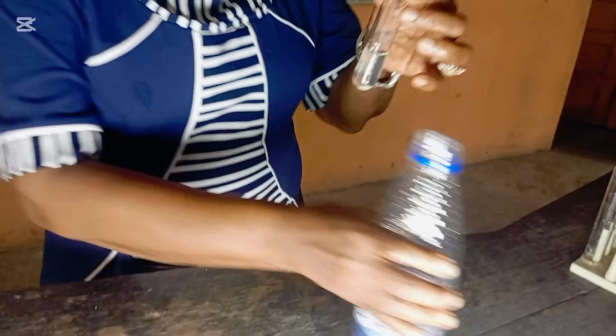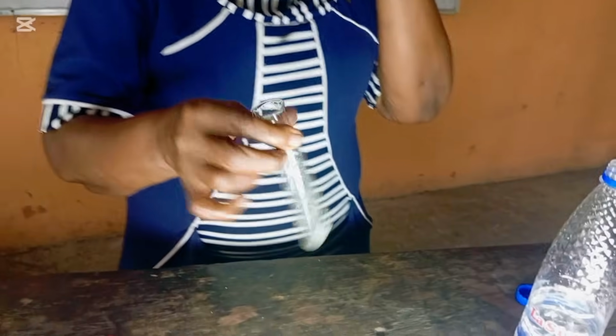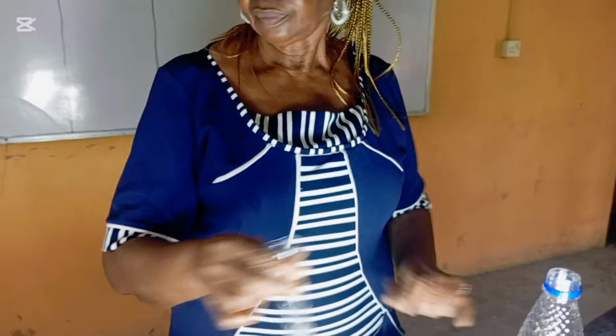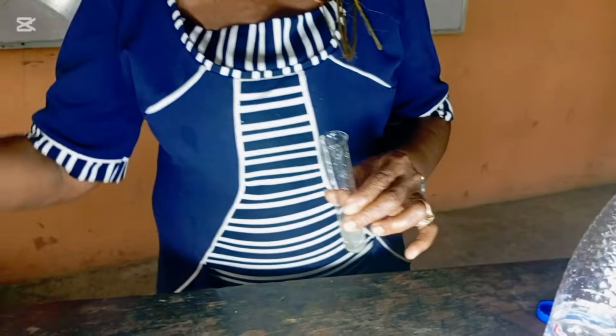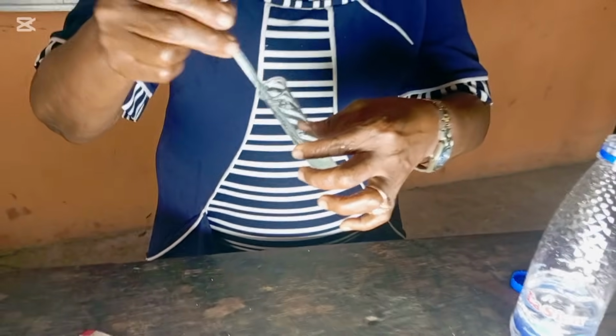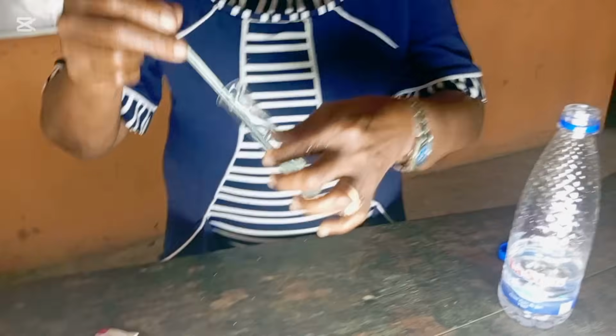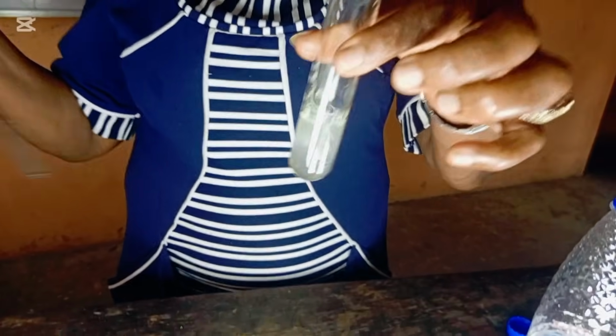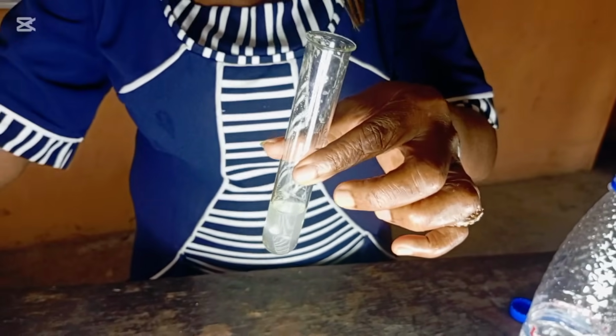Allow it to dissolve. You can use a stirrer, being very careful, to give a colorless solution.